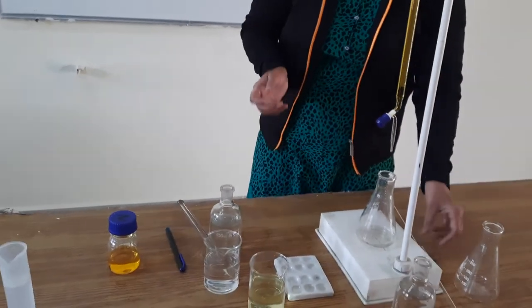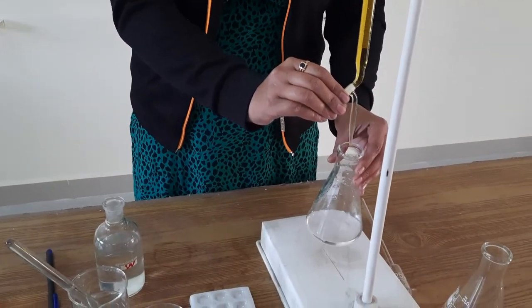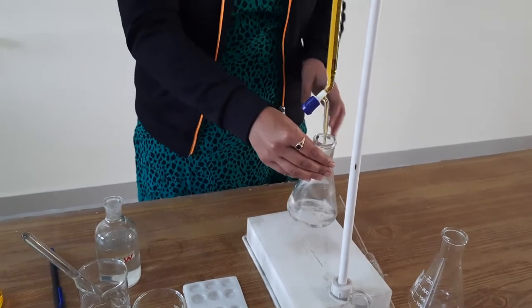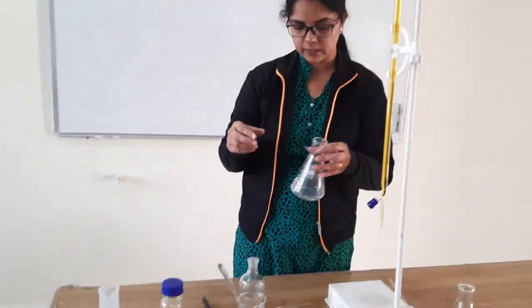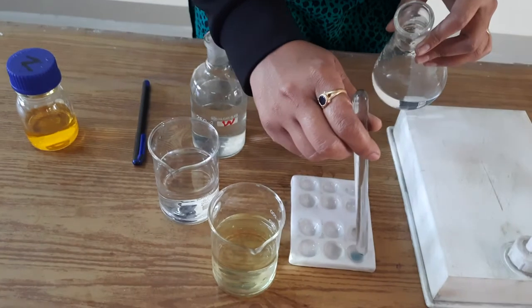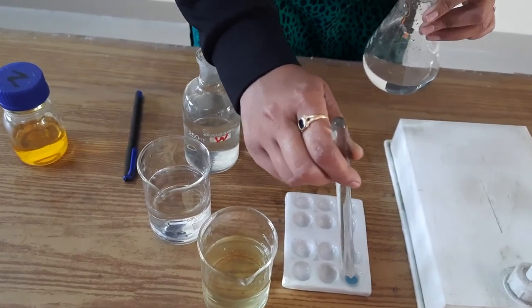Your setup is ready now. We start titrating — we take our reaction mixture and test it with the external indicator on the porcelain disc. We start from 0 and at every 1 ml we check for the blue color. We slowly add drop-wise with continuous shaking so the reaction mixture is properly mixed. After adding 1 ml, we take a drop of the reaction mixture and add the external indicator. As you can see, it is showing blue color, meaning the complex is forming — we have to titrate more.